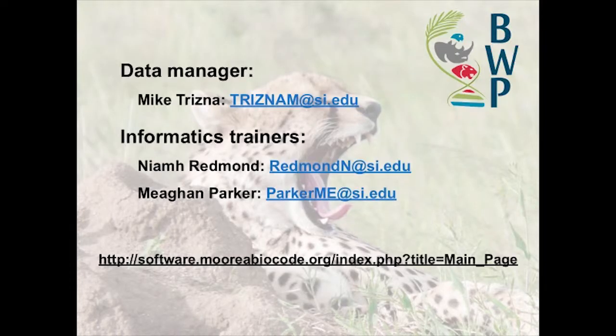This brings us to the end of our Introduction to Geneious tutorial. Please remember to visit the Biocode Wiki site and read through all of the Geneious LIMS resources provided there. And please contact us if you have any further questions regarding the information in this video.